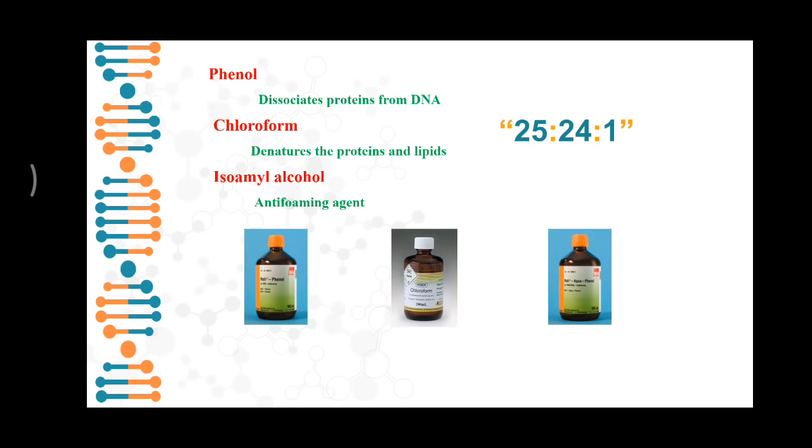Here, the chloroform allows proper separation of the organic phase and aqueous phase, which keeps DNA protected in the aqueous phase. Isoamyl alcohol will be acting as an anti-foaming agent which protects the integrity of DNA.